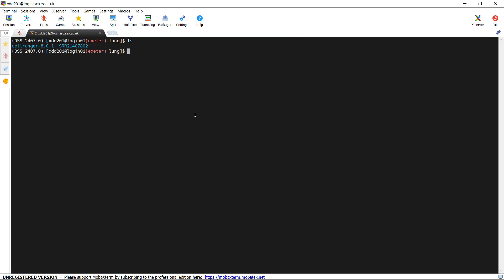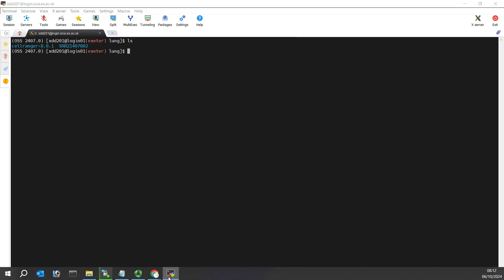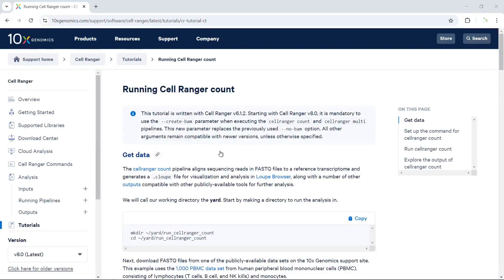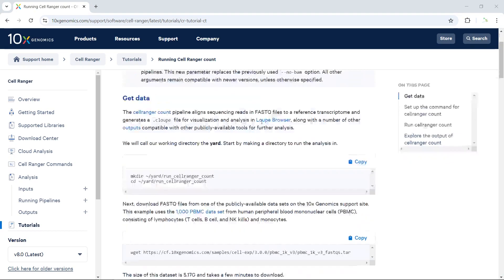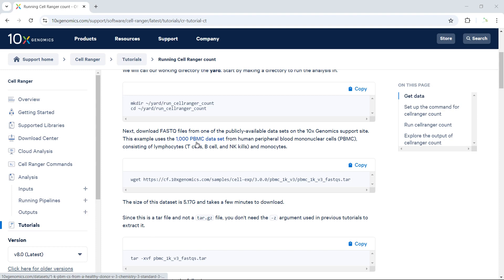Let's have a look at the 10x Genomics online tutorial. You can see here, this is the website showing how to run the Cell Ranger count function. We are going to use the 1K PBMC dataset for the demonstration. You can copy the link from here to download the data, so let's copy the link.